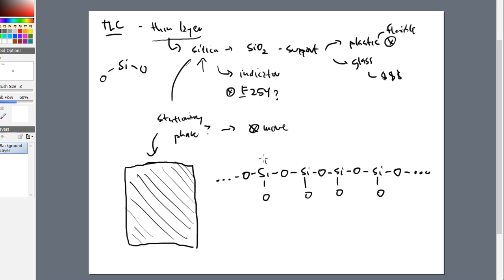Now, the silica will also have another O on them, typically, SiO2, and there's linkages of oxygens in between, but the surface of this tends to be somewhat acidified a little bit, so there's hydrogens that are loaded on them. It's not just going to be a free oxygen out there, okay? We're going to give oxygen its needs, and we're going to load an H on it, so we actually put alcohol groups on here, don't we? Look at that. Oh, how beautiful was that, right?